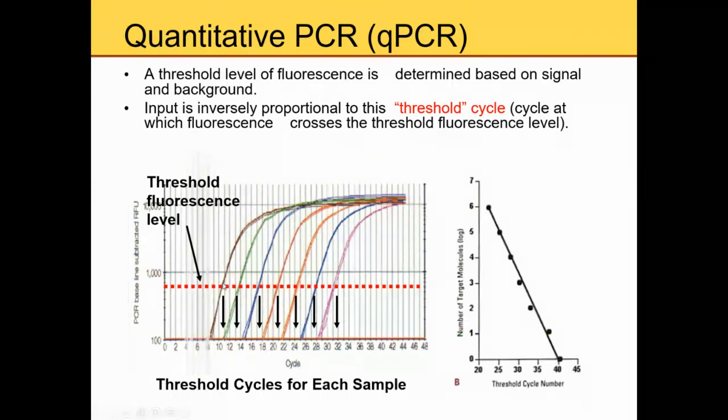The threshold level means after you remove the background, right? Then that'll be the threshold level that's starting the amplification. Let's say the threshold is here. Then that will be the first, 0 cycle, and then 1, 2, 3 cycle. And this curve shows you the real-time DNA quantity, all right?